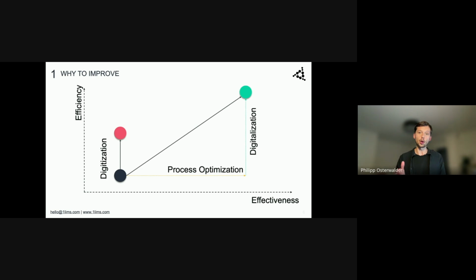And this will be a long-term sustainable improvement and added value to this lab team, because there is less donkey work, less annoying work they have to do, and the main processes are much faster and much more reliable. So the team is happy and they reach their goal much faster.